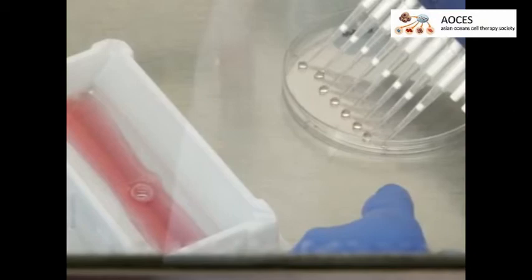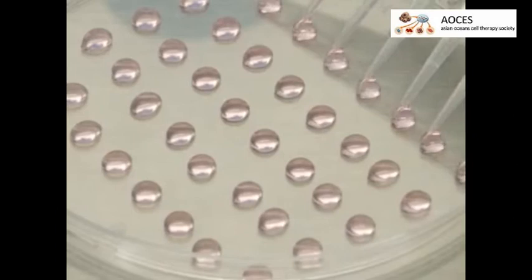Use a multi-channel pipette to form 20 microliter droplets on the inner surface of a 10-centimeter dish lid. In all, pipette 5 rows of 8 drops for a total of 40 drops.